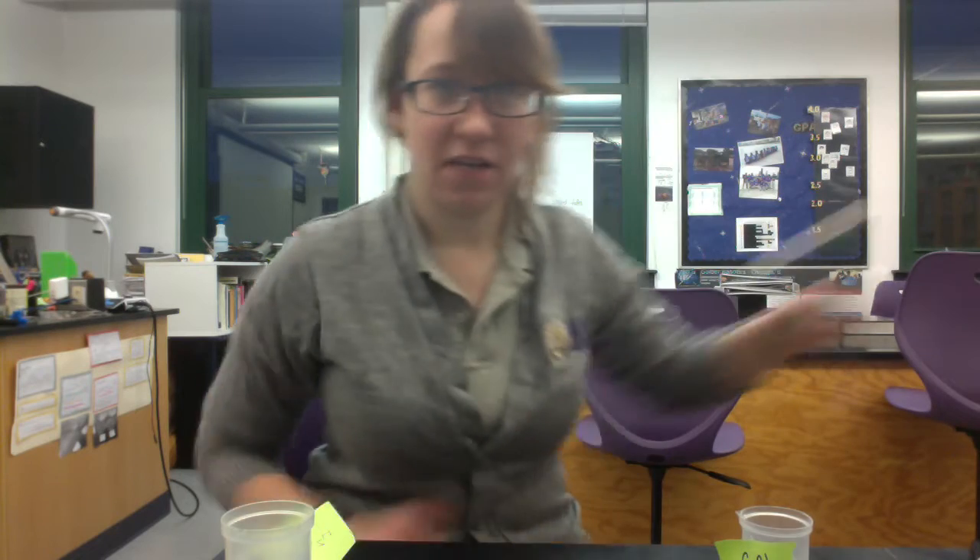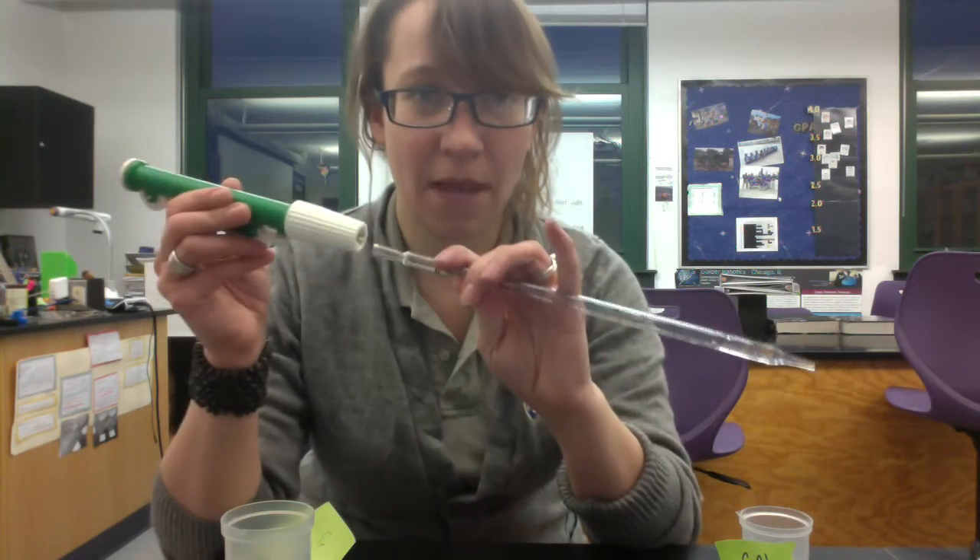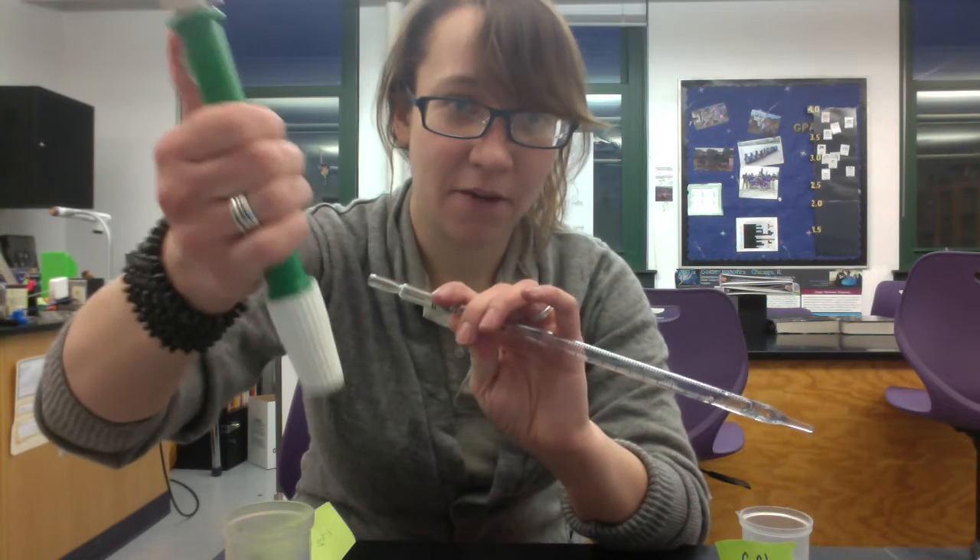The last thing you need is this device called a serological pipette. This is the pipetter, and this is the pipette. The pipette is what we use to draw up liquids in a carefully measured way.